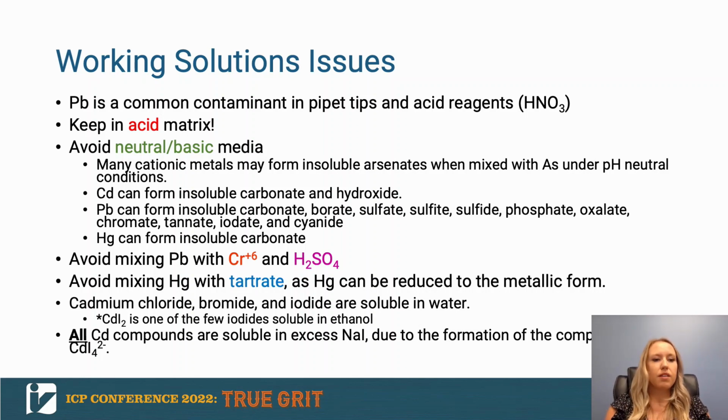But one thing to keep in mind for lead is that it is a common contaminant in pipette tips as well as acid reagents, particularly nitric acid. So you want to make sure that you're using the appropriate grade of acids and that you maybe leach your pipette tips or other materials that you're using to make sure that you're not introducing any contaminants.